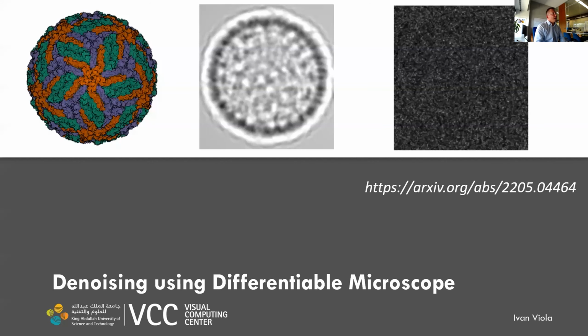Quite a different way to look at it would be to take the recent trends from AI, machine learning, and also computer graphics to try to mimic the microscopy process and evaluate which parts of the microscopy simulation we can actually realize as differentiable ones.